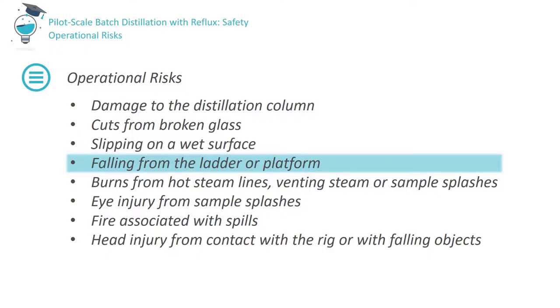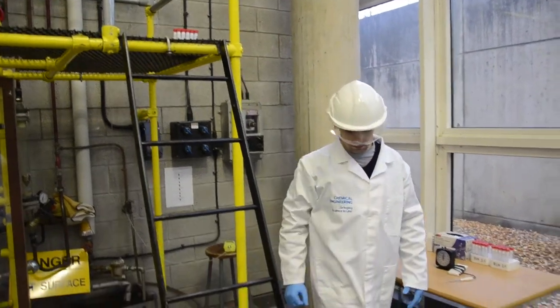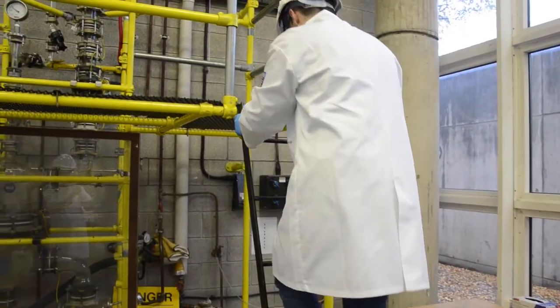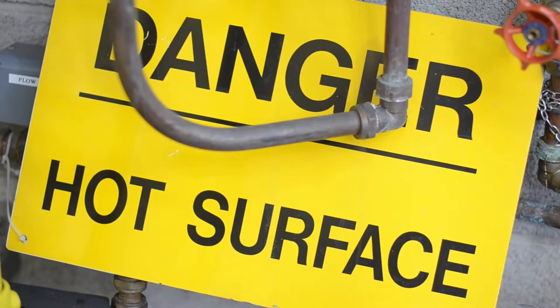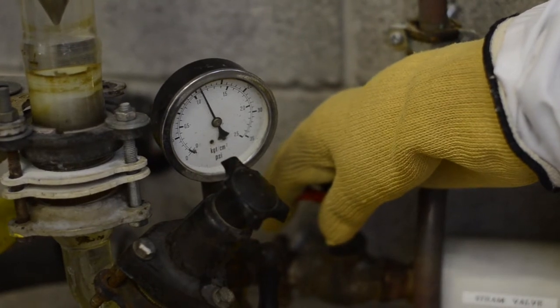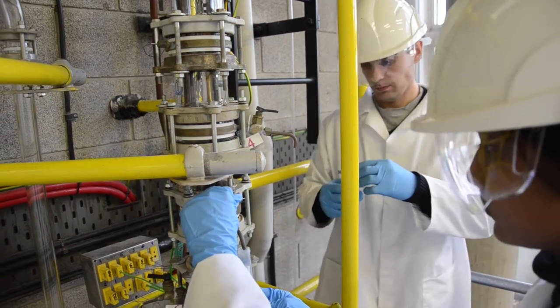Take particular care while climbing onto the rig platform. Never climb onto the rig carrying objects in your hand. Always hold the handrail when climbing the ladder. Only one person may climb the ladder at a time and no more than two people may work on the platform at the same time. Since the equipment is hot during operation, there is a risk of contact burns — wear insulated gloves when handling the steam valve, do not roll up laboratory coat sleeves, and ensure all skin is covered. To minimise the risk of eye injury from splashes, a face visor must be worn when collecting samples. Remember to open sample valves slowly.